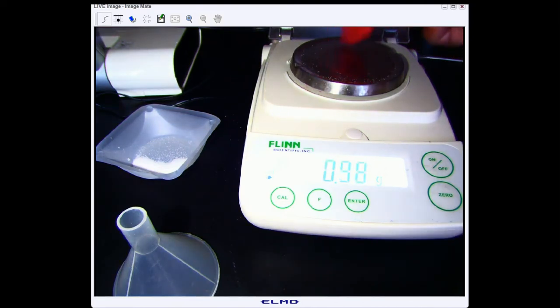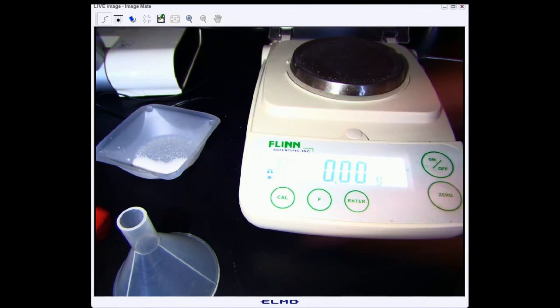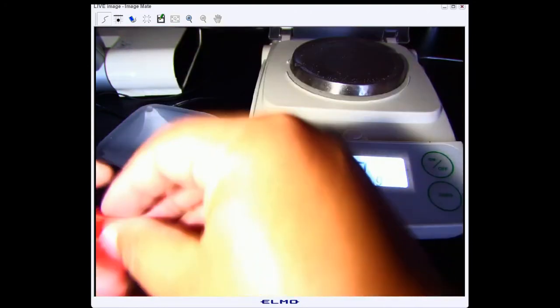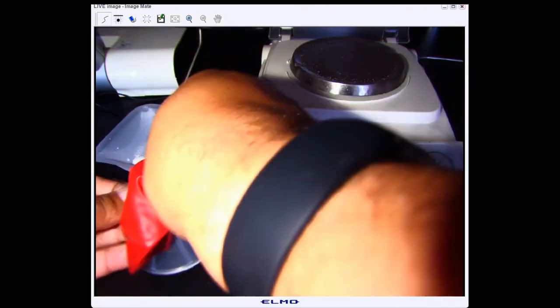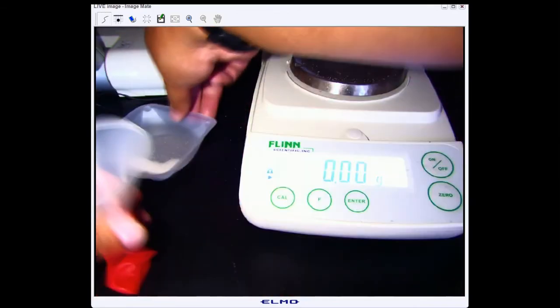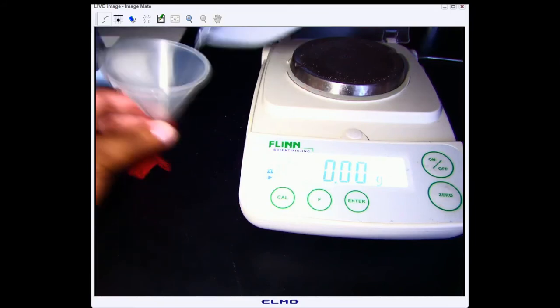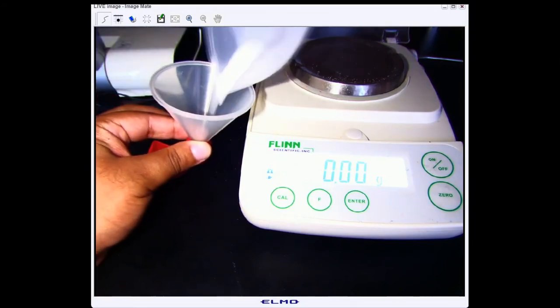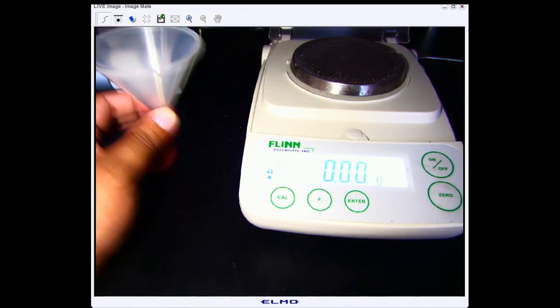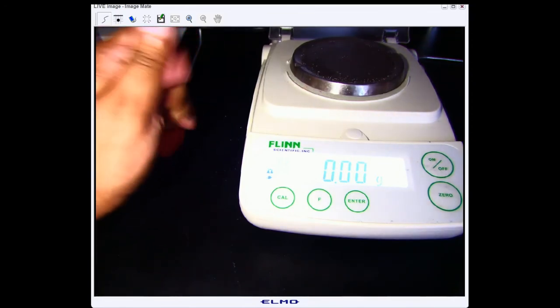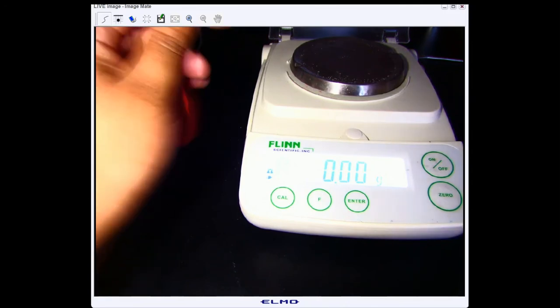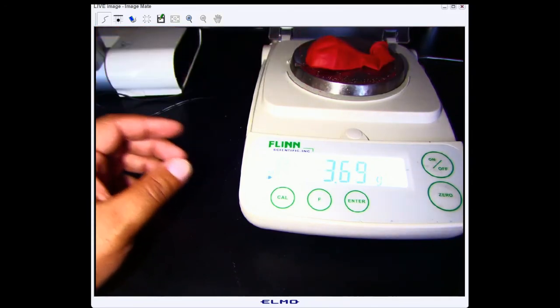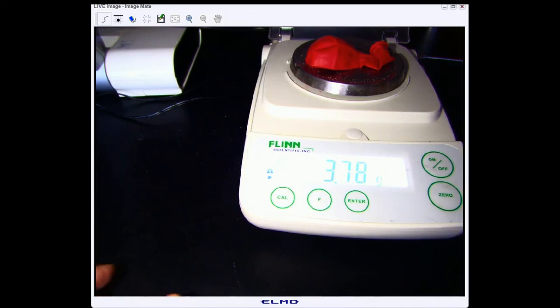Now we're going to transfer it. To do that, I'm going to slip my balloon over the end of this funnel without tearing it. I'm going to take my wayboat, fold it like a taco, and carefully transfer my solid. Now we might have lost some of it, which is why we are going to remass it with our balloon and baking soda, and then record the mass.